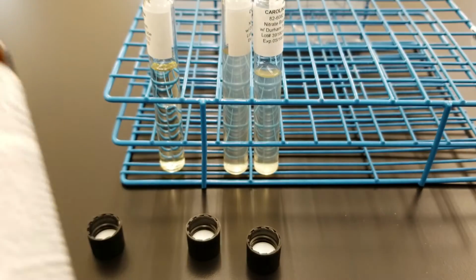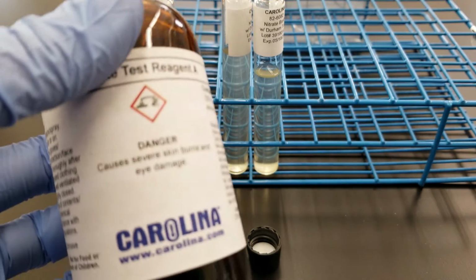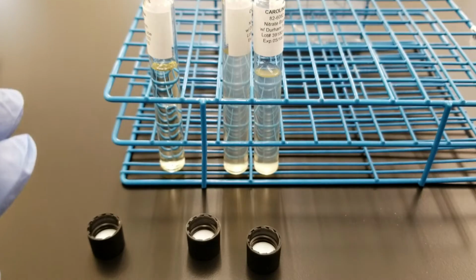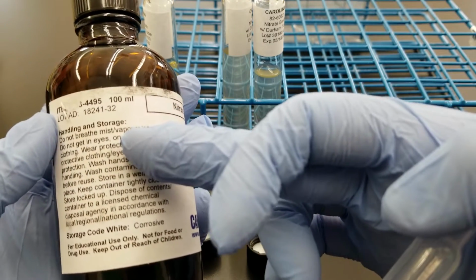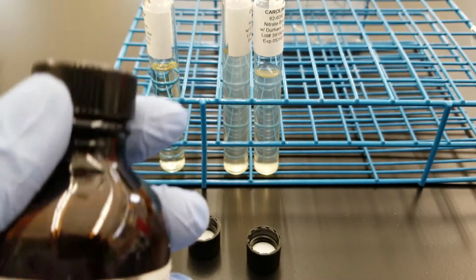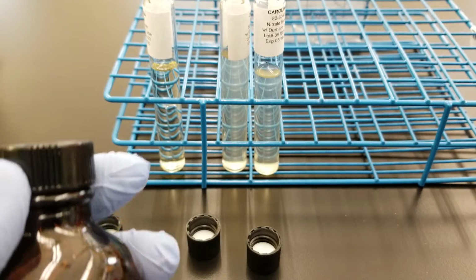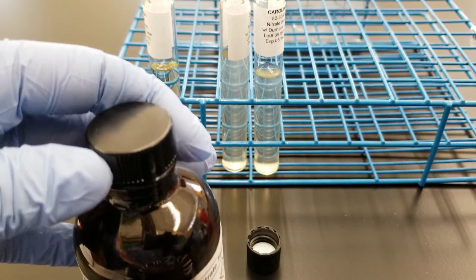You want to keep it in the flammability cabinet. My mistake, sorry, it's not flammable, it's corrosive, but you don't want to breathe the mist and the vapors, okay? So you want to keep your reagents capped, but you can have your specimens open, okay? So hold on just a second.